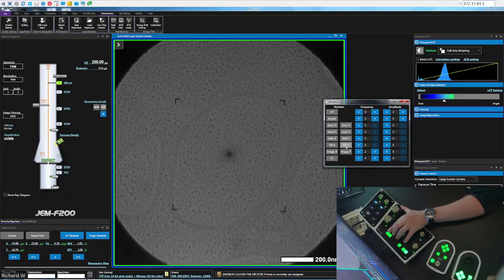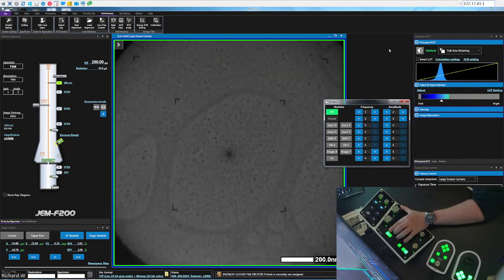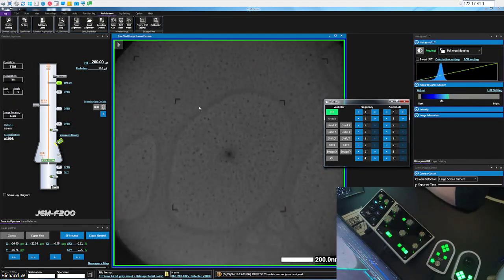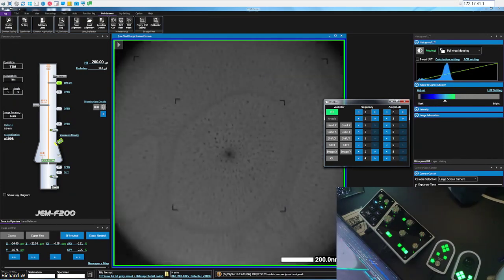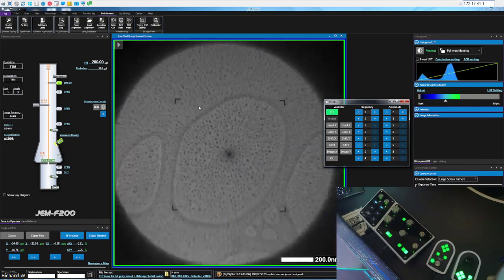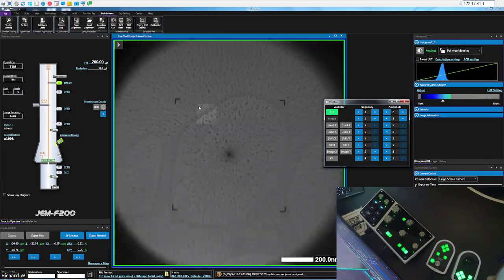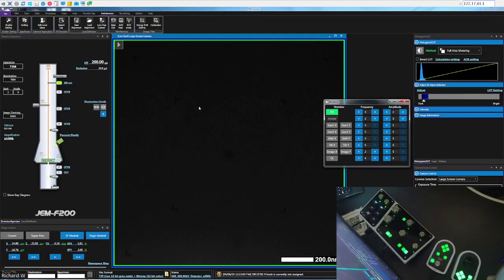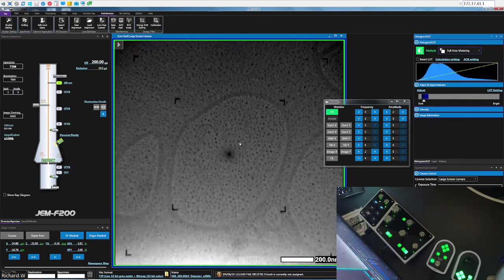So when I turn on the HT wobble, the first thing we'll notice is that the edges of the beam are expanding and contracting. Now, typically this means that our beam is not parallel-sided, but is focused in. And so I'm going to, with the brightness knob with my left hand, which you can't see, spread the beam so that it's barely visible. Okay, and this, just change the automatic contrast brightness.